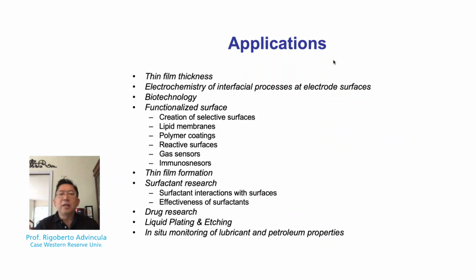So the list can go on, and suffice it to say, QCM is a very widely useful tool, along with techniques like surface acoustic wave or SAW methods and other types of transduced techniques that are very sensitive to surfaces.